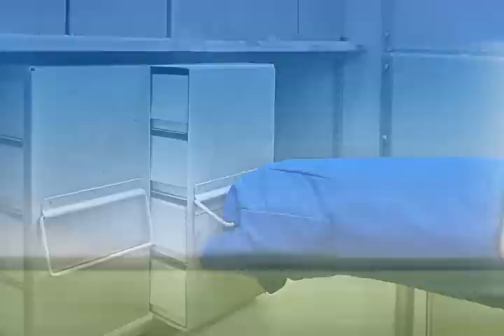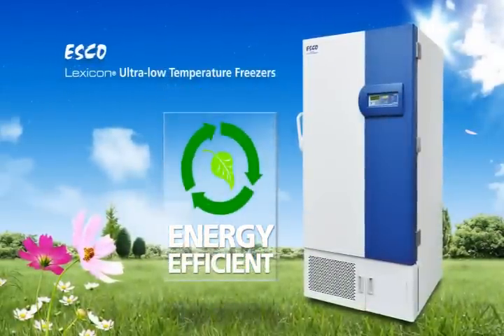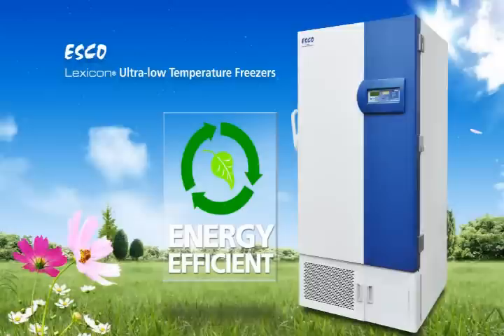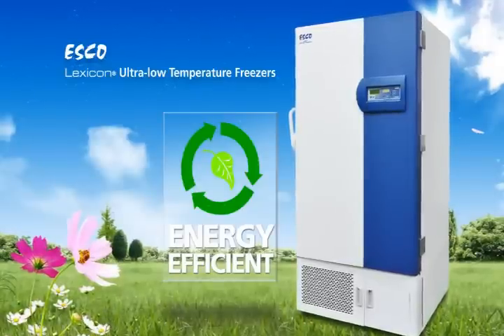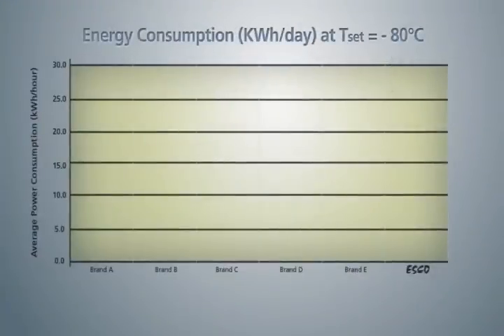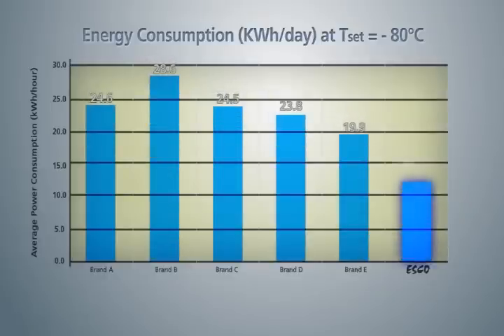Running a ULT Freezer can be very costly. In the long run, an energy-efficient freezer results in a lower total cost of ownership compared to a poorly designed freezer. ESCO ULT Freezer has the lowest energy consumption among conventional ULT Freezers of similar size.